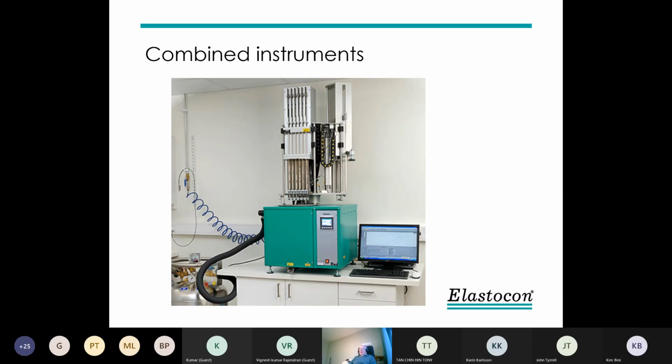By the way, to use liquid nitrogen, we have the liquid nitrogen container here. Then we use a type with so-called self-pressurizing. It means that normally the evaporation of liquid nitrogen gives a little pressure inside, but if you need to have more flow of liquid nitrogen, you need to add to that pressure, and that is then a little coil here. So you will take up some liquid nitrogen in that coil, it evaporates and goes down the back as, say, pushing gas, pushes out to keep the pressure of around something around 1 bar.